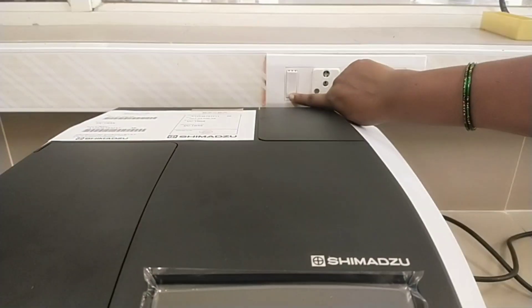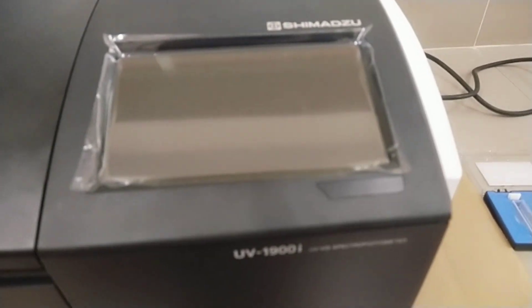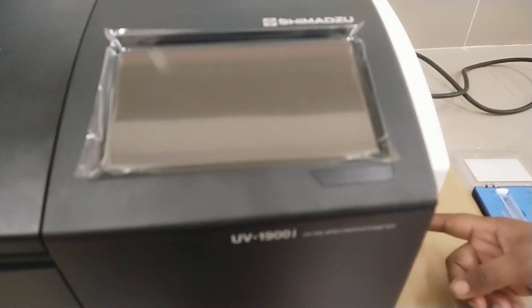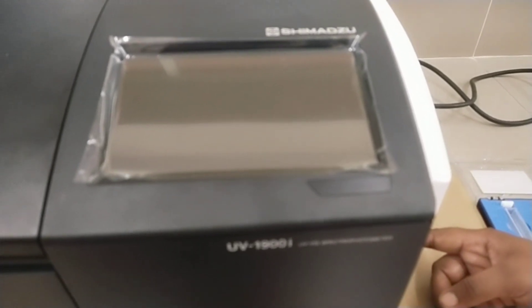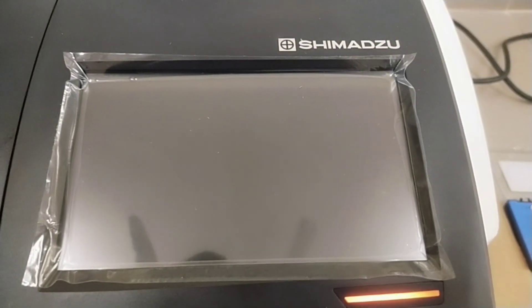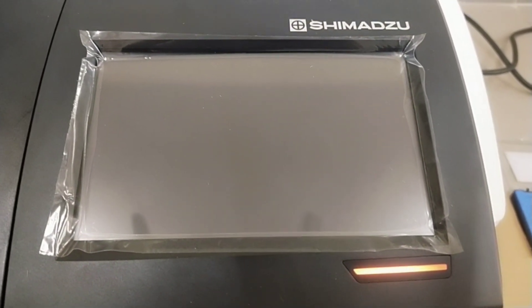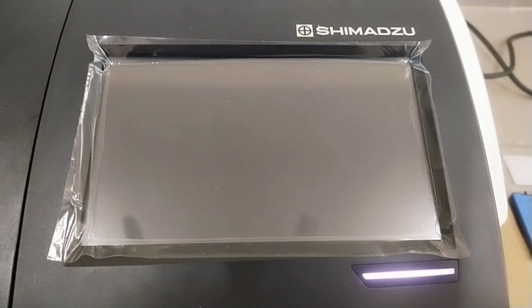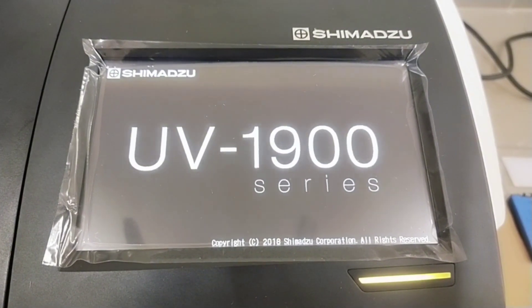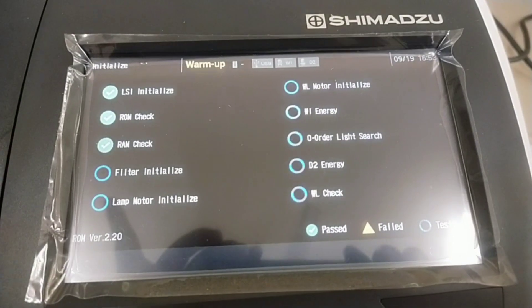Before switching on the instrument, confirm that nothing is placed in the sample compartment and cell holder. Switch on the instrument by pressing the power switch. The power is turned on and the screen displays initialization items. Initialization requires approximately 2 minutes. To measure data stably, it is recommended to warm up for 30 minutes or longer.